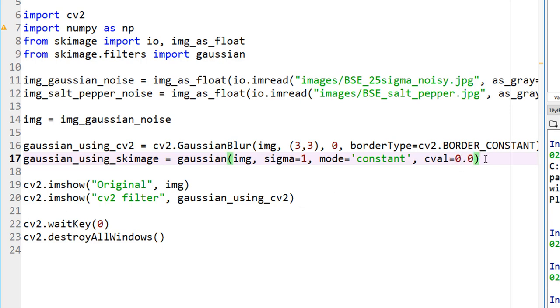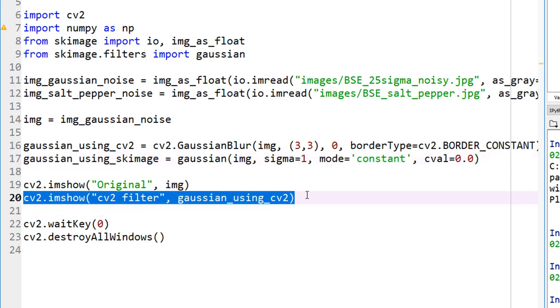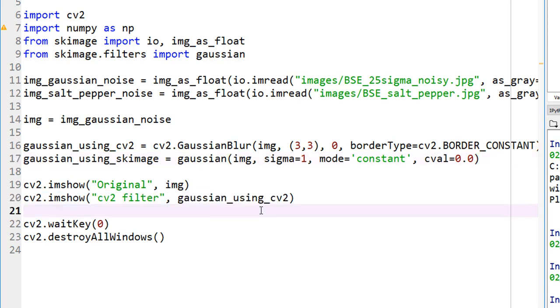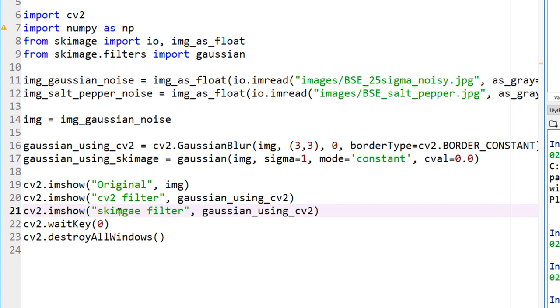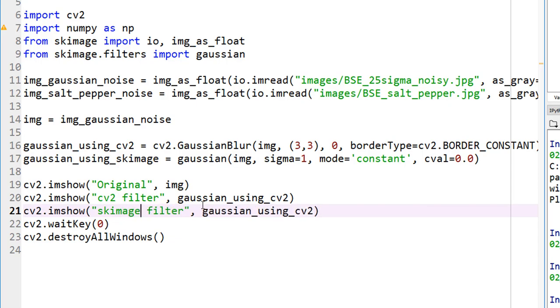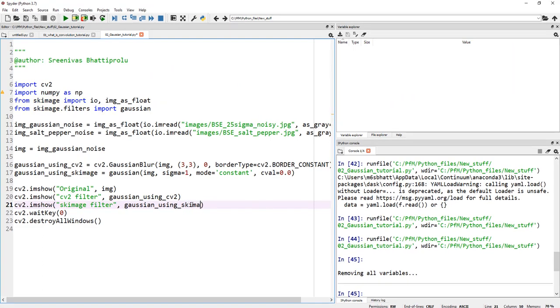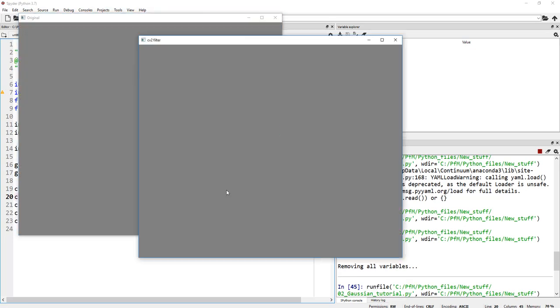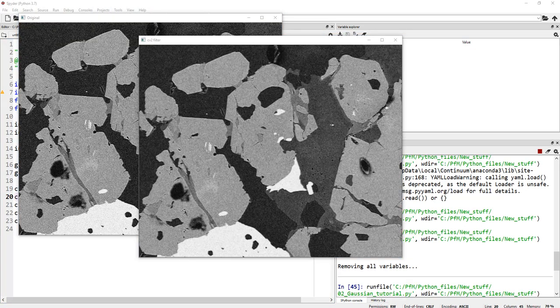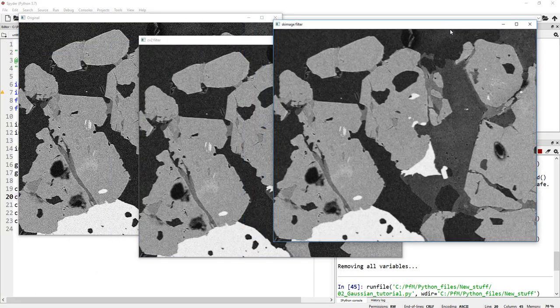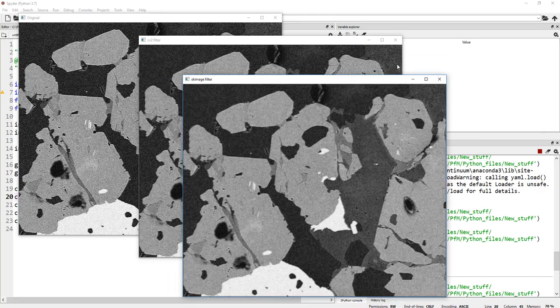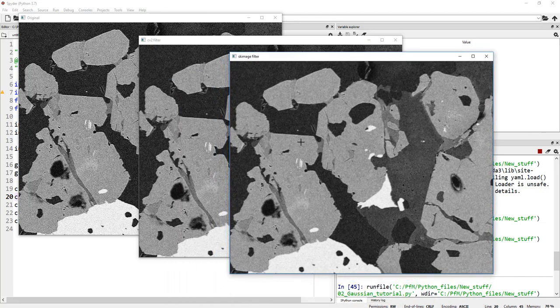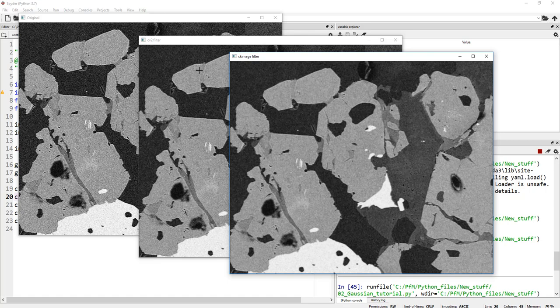Let's show this image also here. Let's copy this, skimage, and this would be Gaussian using skimage. Assuming there are no typos, let's go ahead and run this. There you go. Everything looks fine. You can see here is the scikit image filter, here is the cv2 opencv filter, and here is the original.